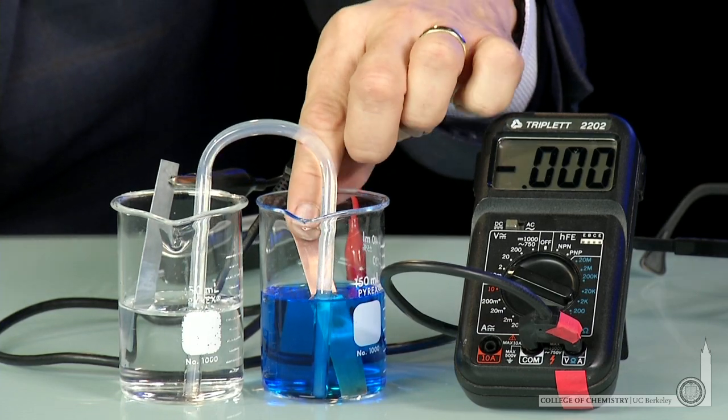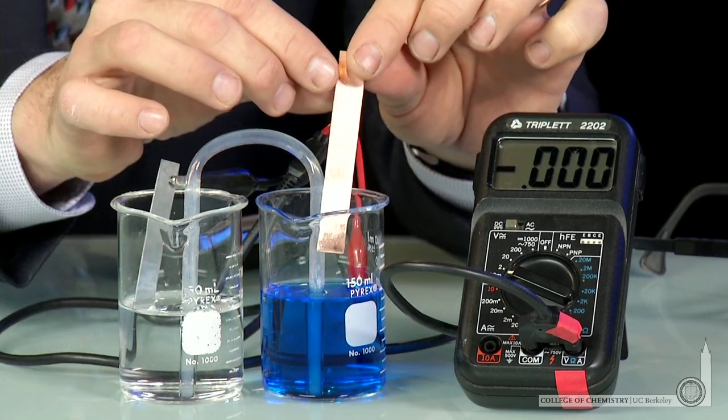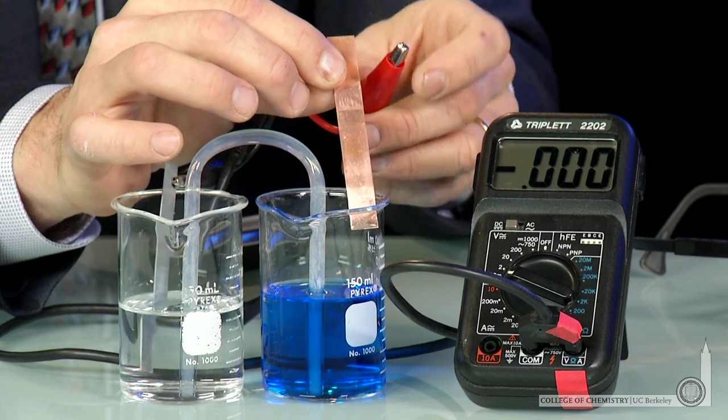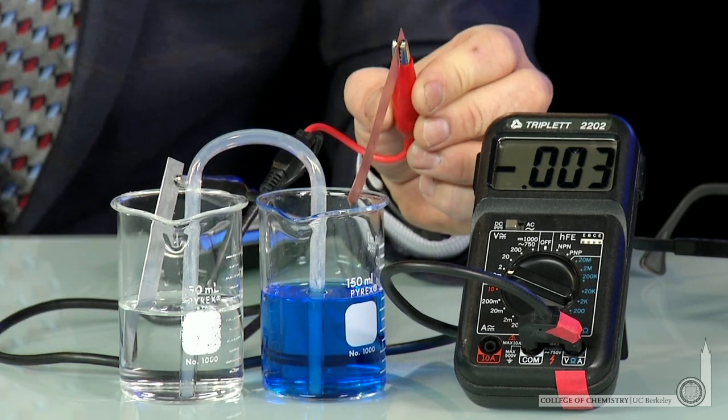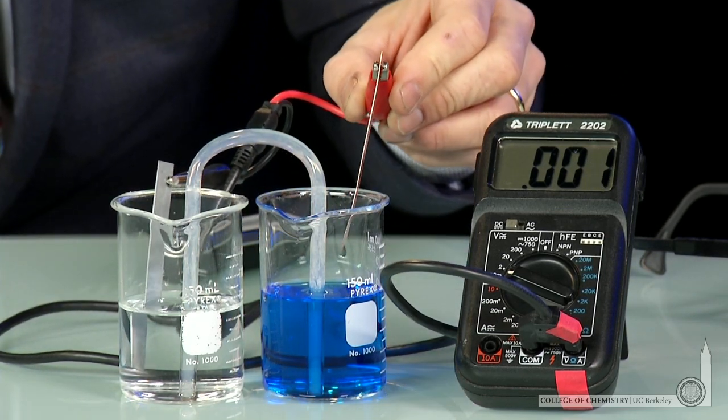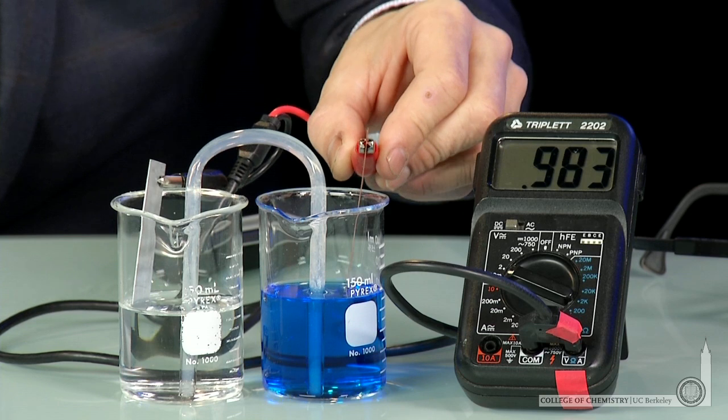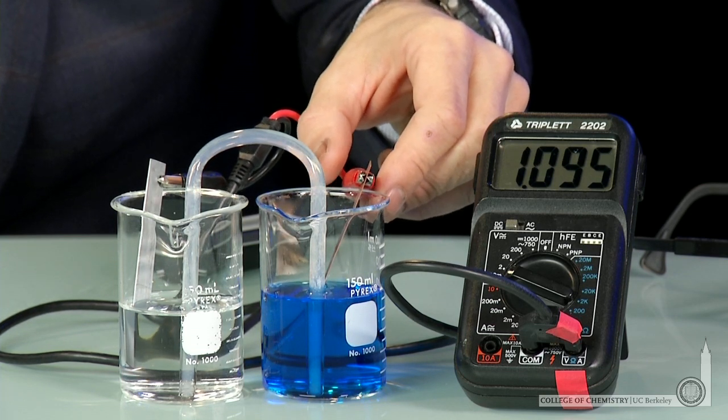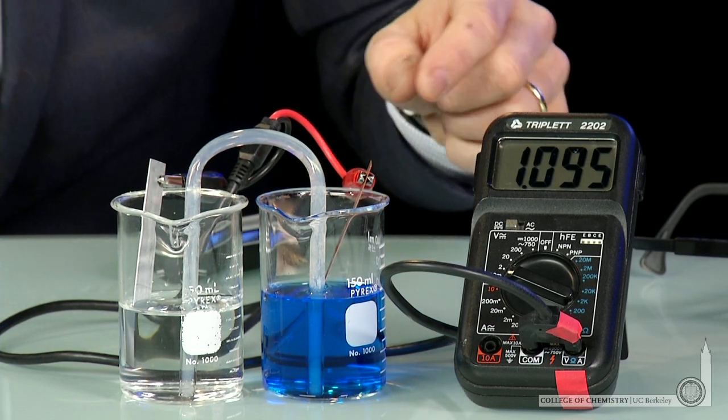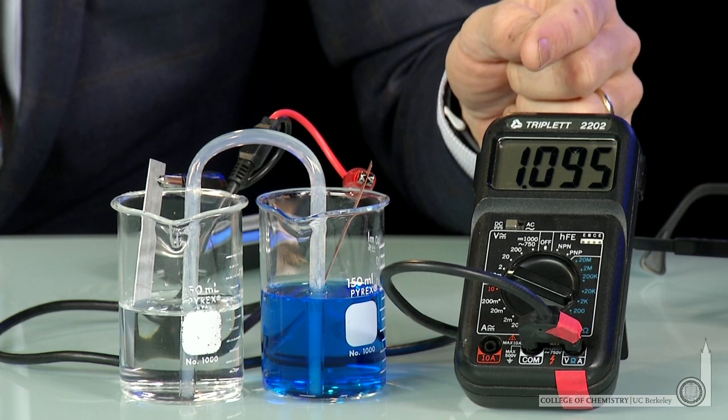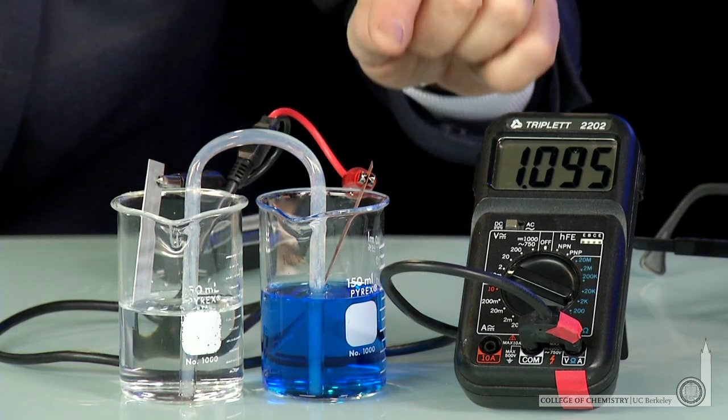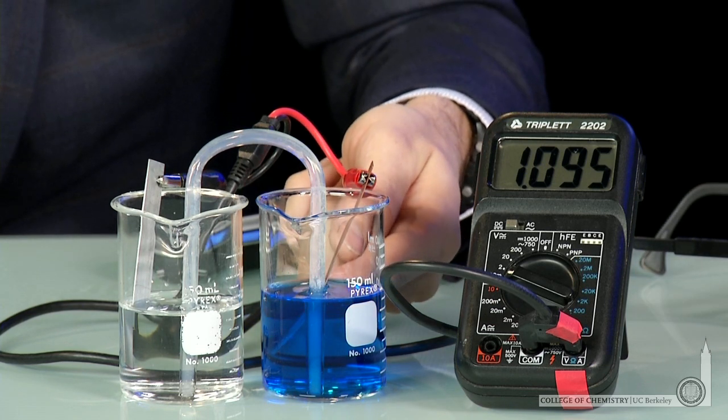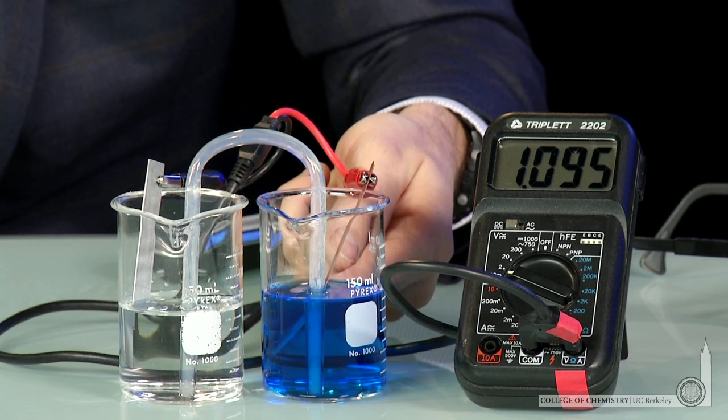Now if I take the copper electrode and I connect it to a voltmeter, notice right now my voltmeter reads zero. But if I put the voltmeter between them and immerse the copper electrode in copper solution, notice the voltmeter reads the potential for electrons to flow from the zinc metal to the copper metal and eventually to the copper ions in solution.